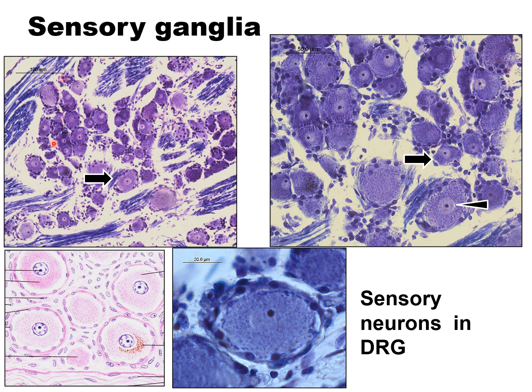Here mainly you can see the neurons and the supporting cells, and in the periphery you can see the nerve fibers. This is hematoxylin eosin stain, dorsal root ganglia, central nucleus, and Nissl granules. Already we have mentioned that it doesn't stain, or it stains very mildly, with hematoxylin.